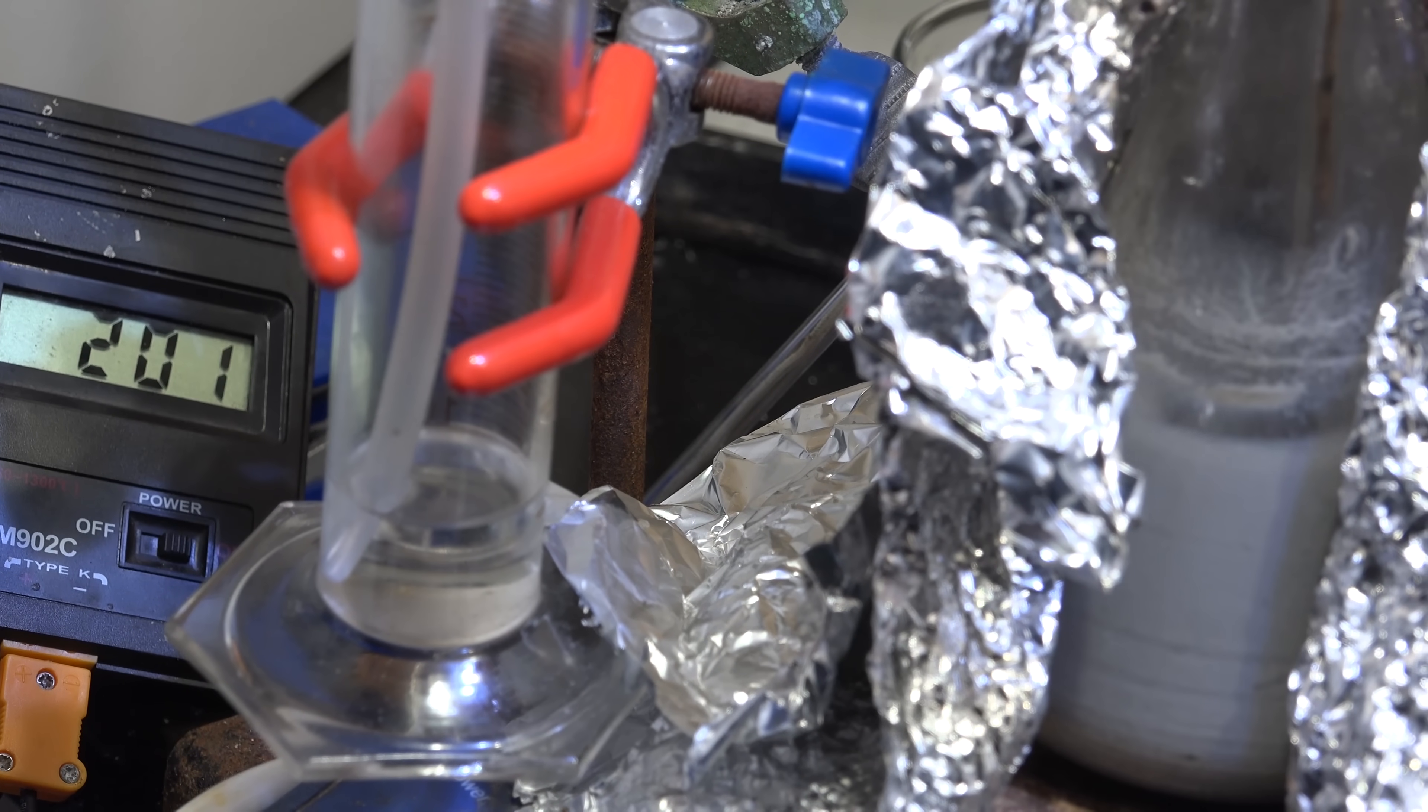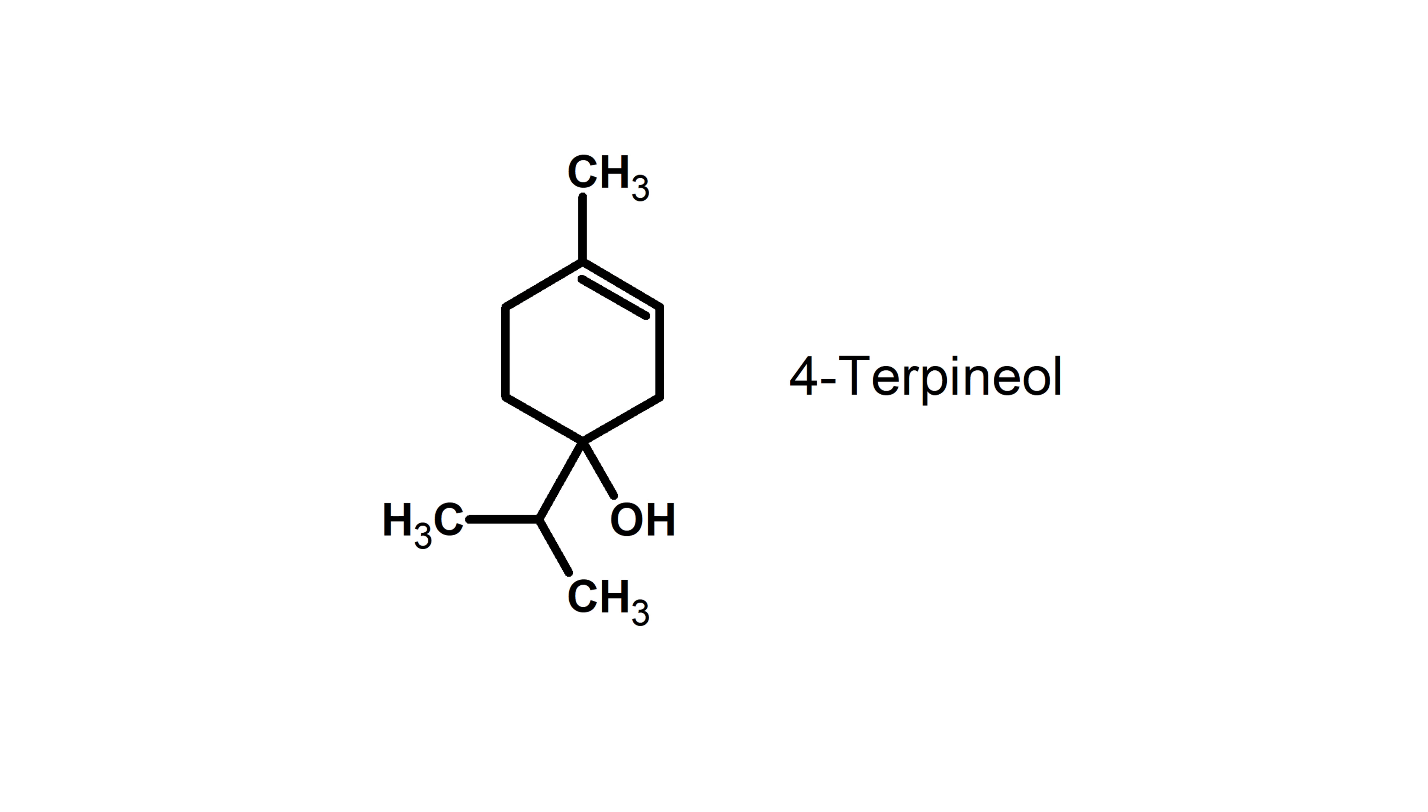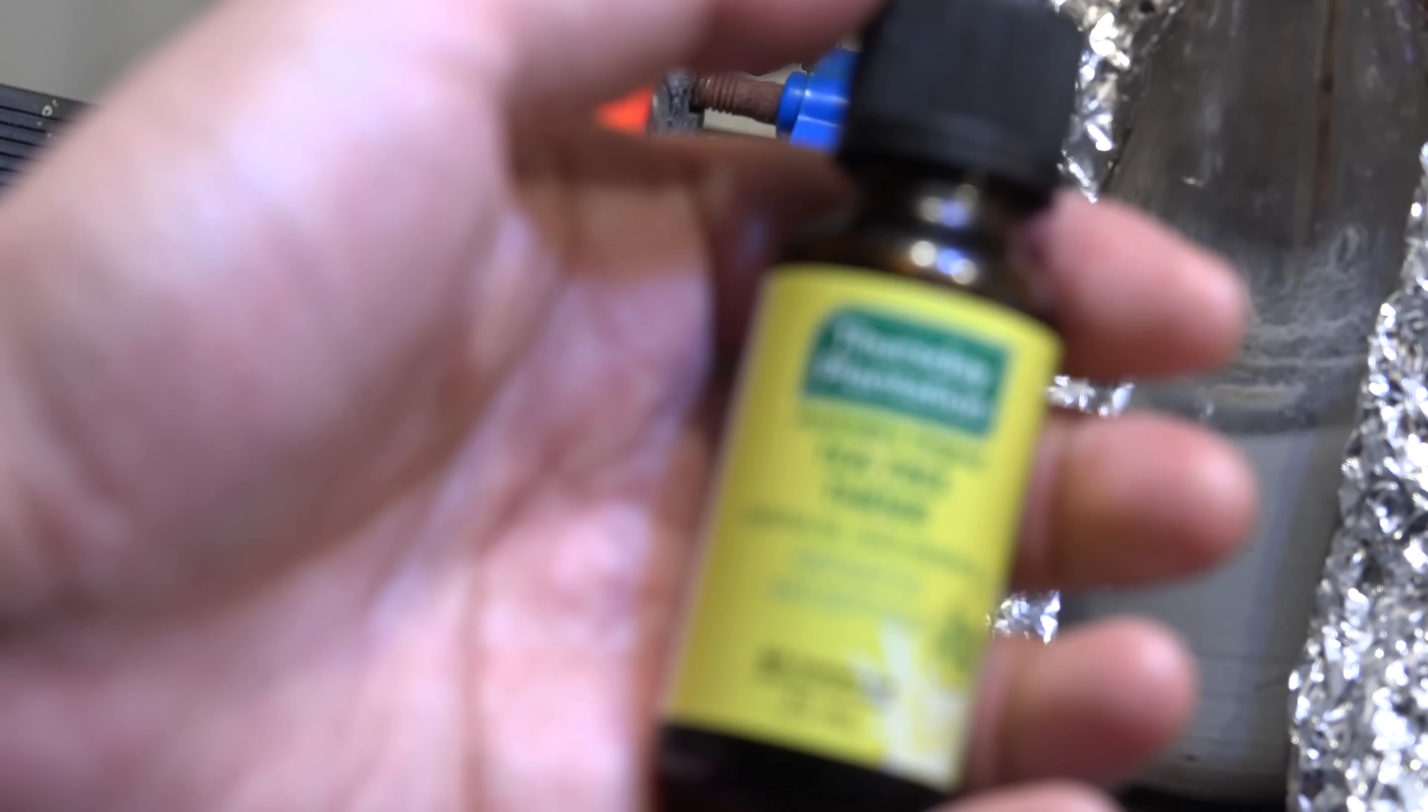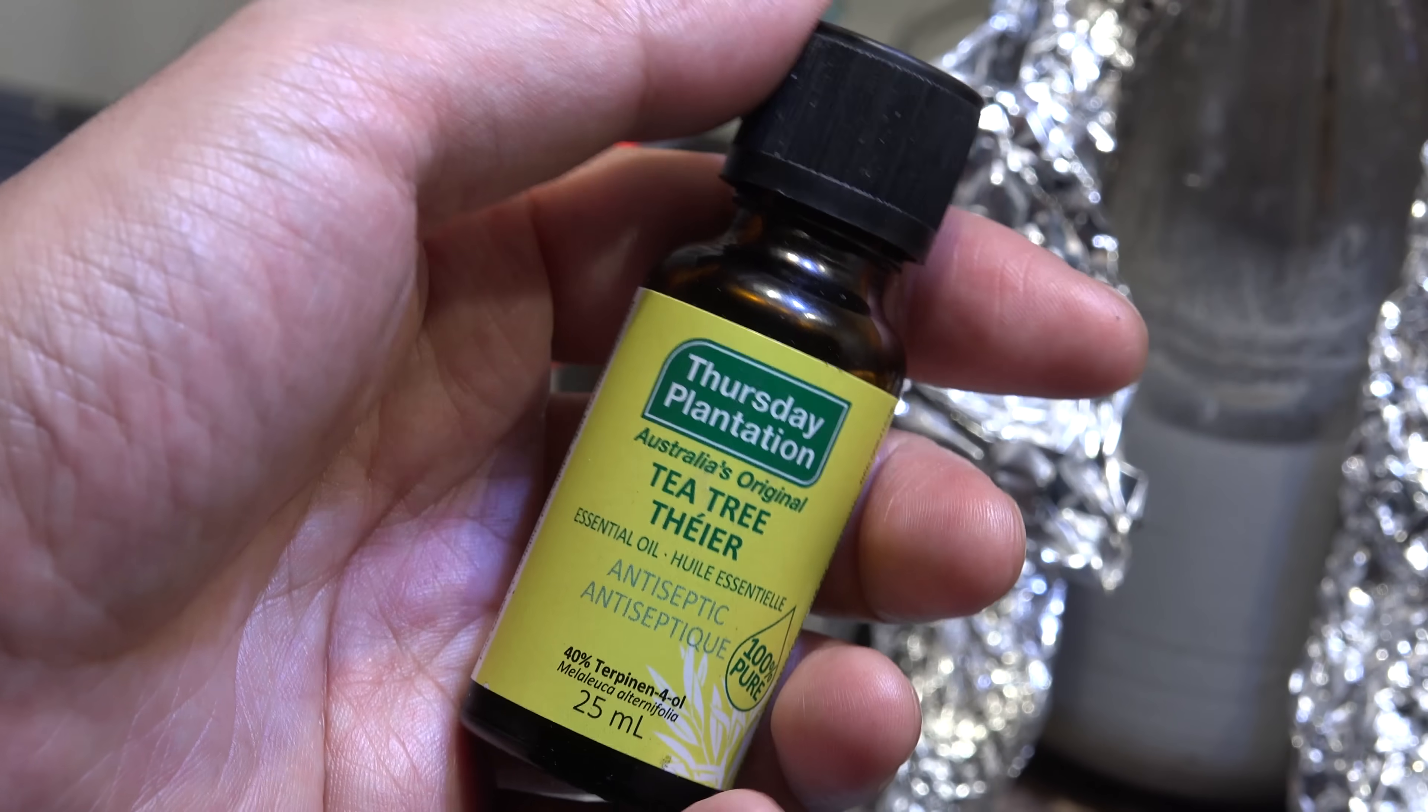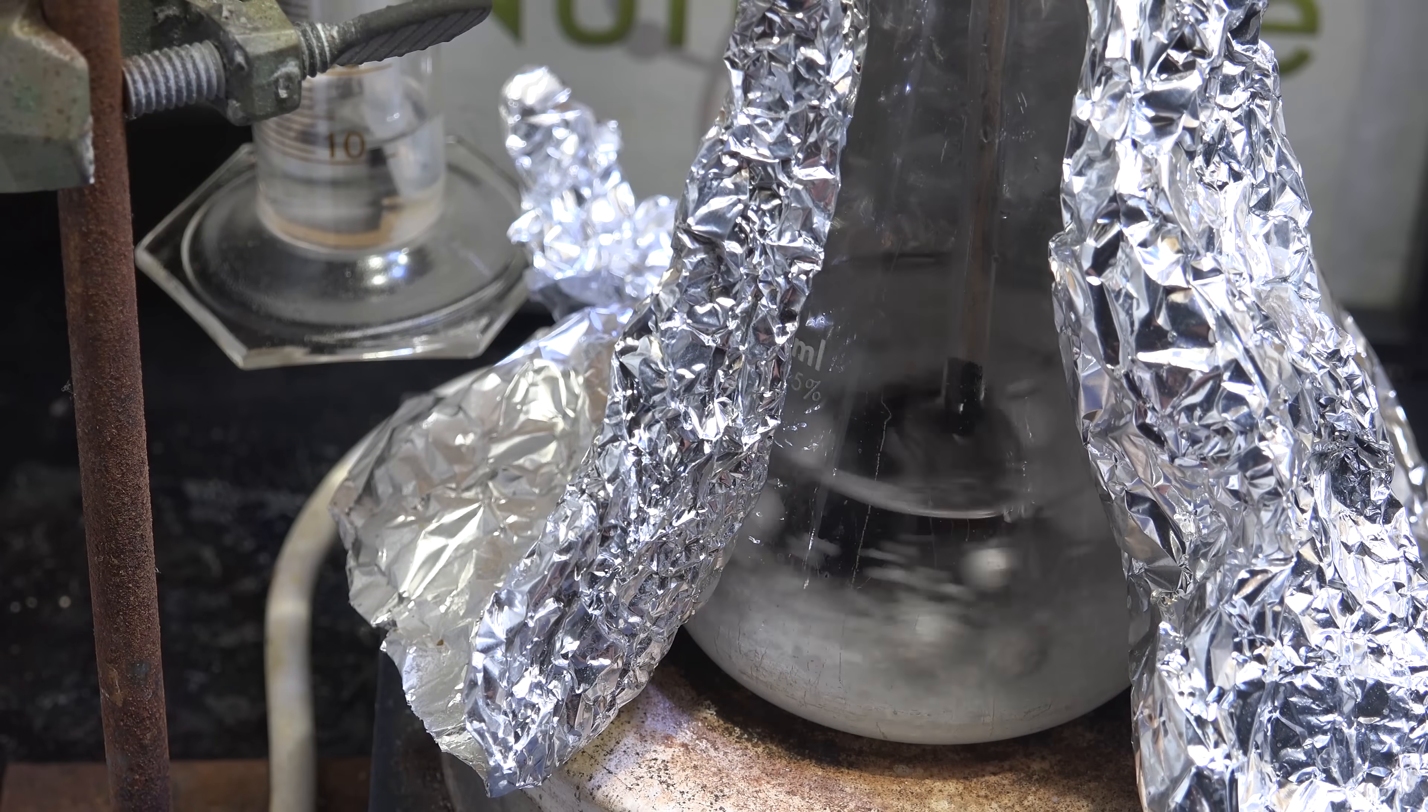So moving on, let's try some very easy to get tertiary alcohols. My first candidate that I've been waiting all this time to try is terpinen-4-ol, also known as 4-terpineol. Now it looks exotic, but you're going to laugh when I tell you where it can be found. It's one of the main components of domestically available tea tree oil. I got this bottle from my local Walmart, so let's give it a try.